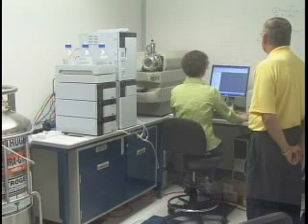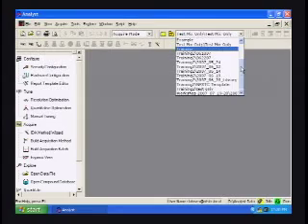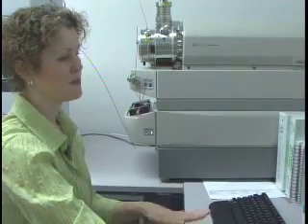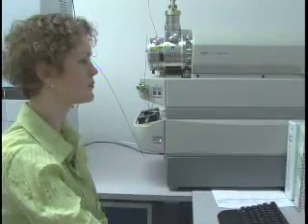The first thing we need to do is change our project. Which project would you like to put this in, Bill? Oh, that's right. As Bill said before, we don't want to run these in the API instrument folder. You can put them in any other project you want to.